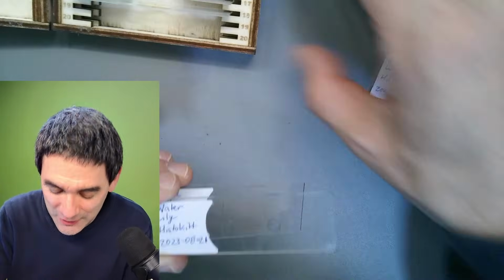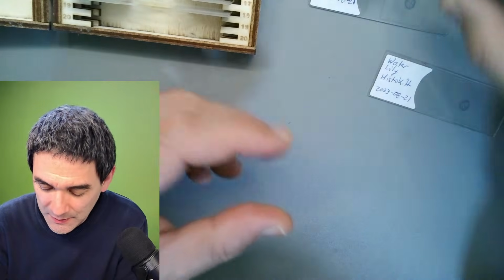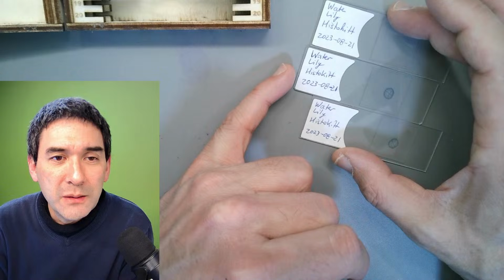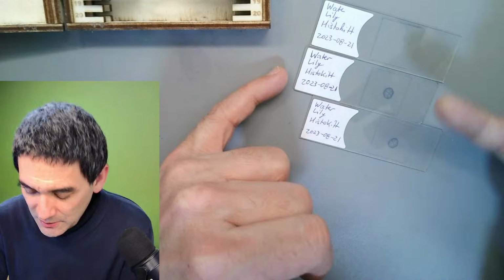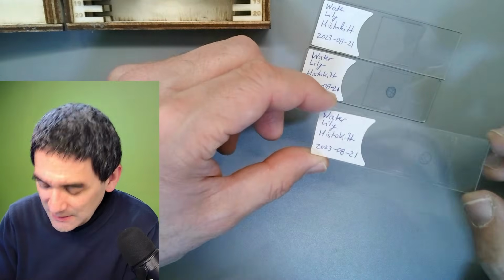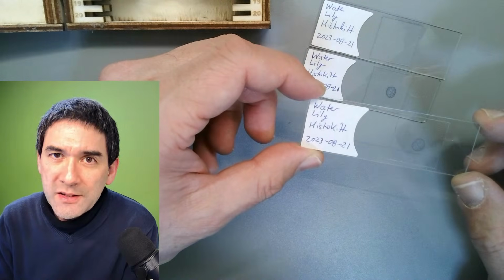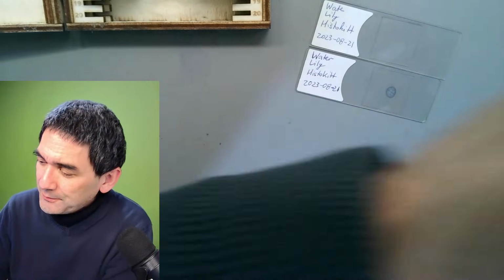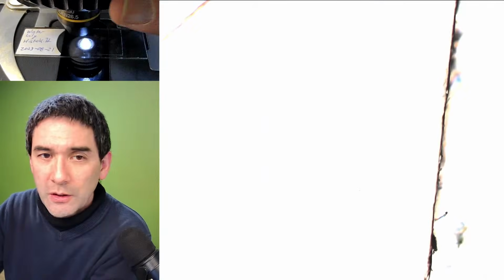Let me quickly go to the desk view again, because these are really interesting. That's a water lily. It was mounted in Histokit. I don't know that mounting medium. These are some cross sections, and I want to show them to you because they contain so-called idioblasts. Idioblasts are cells that also have crystals, and the crystals in here are really interesting because they look very different. I have to find them. There are not that many of them in here, but they are quite nice looking.